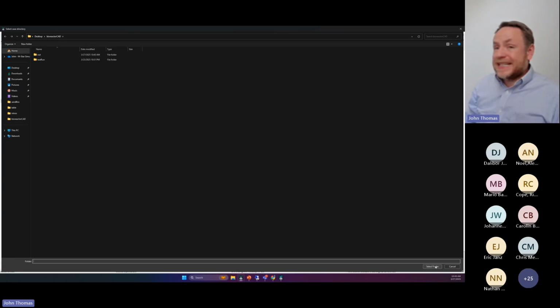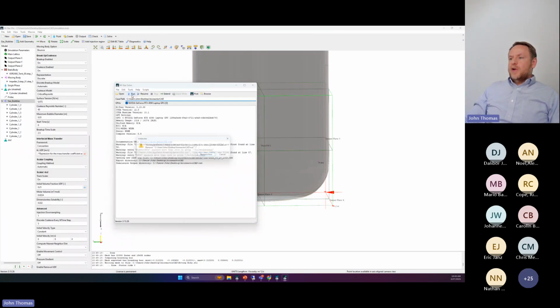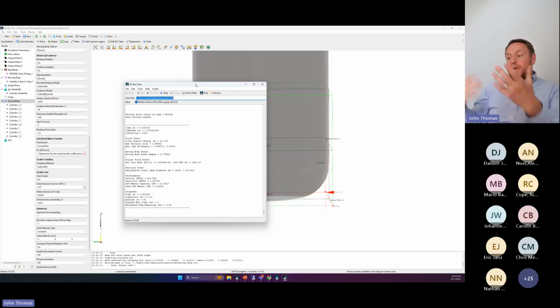And I can use this to predict dead zones, oxygen dearths, as it were. And I'll show that momentarily with my previous run simulation. I look at where oxygen's going, where oxygen isn't going, where bubbles are going, where they're not going, and how, here's an important point, my bubble composition is changing. This is a very important point, is that as air bubbles give up oxygen, they bring less to the party. And as a consequence, in a very tall vessel, very large vessel with very large residence times, your bubbles begin to become less effective. We can capture that. We can capture the stripping effect as it works.